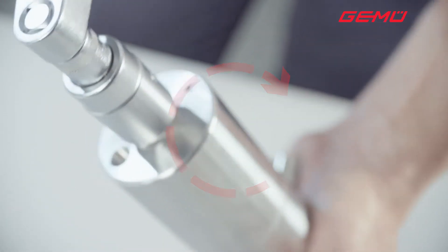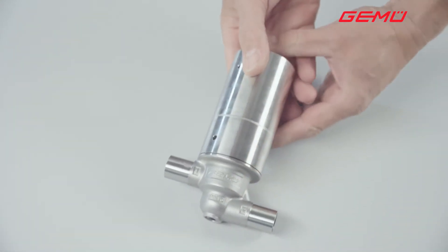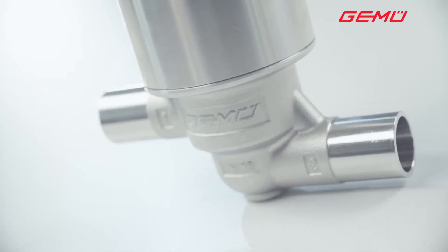After connecting the control air, the valve is once again ready for operation. Changing the cartridge on the GameU F40 filling valve is complete.